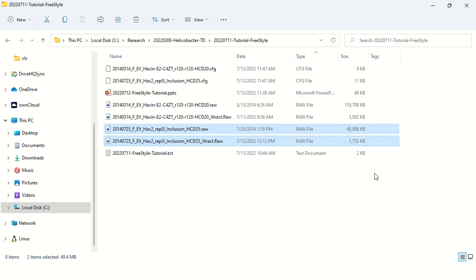And instead of representing the spectrum as profiles, we tend to represent the deconvolution in centroids instead. So we're giving a list of masses where before we had a sampling of the entire peak shape. The other thing is that a proteoform tandem mass spectrum is likely to be highly redundant compared to the tandem mass spectrum in deconvolved form.